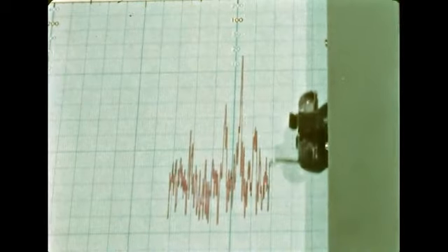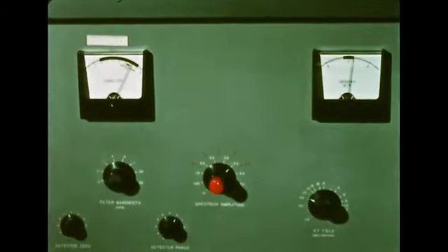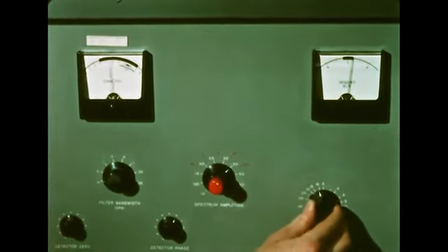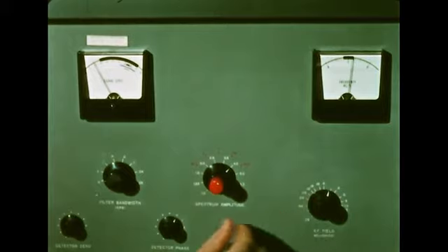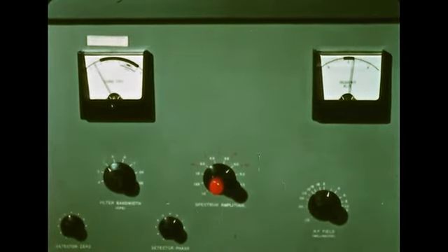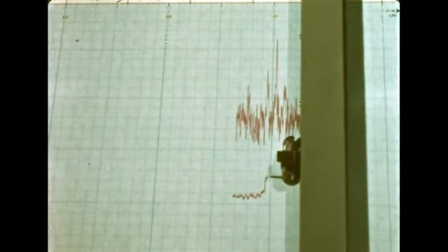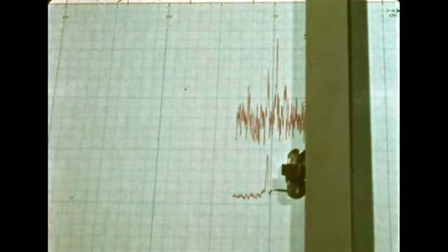A great improvement in signal-to-noise ratio may be obtained by increasing the intensity of the radio frequency field and by adding filtering as necessary. Filtering, or damping, simply makes the recorder pen respond more slowly so that it does not follow the high-frequency noise.